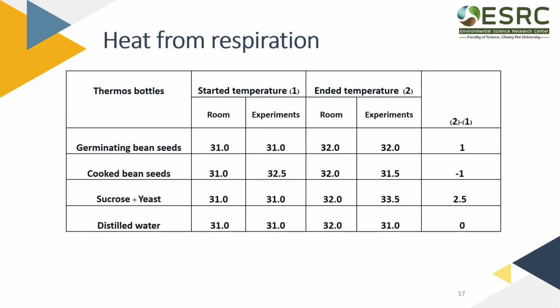The results were shown in this table. You will see that the temperature of the germinating bean seeds and yeast bottles increased, while that of cooked bean seeds decreased. However, the temperature was stable in the distilled water bottle. Record and discuss the questions on your lab report.